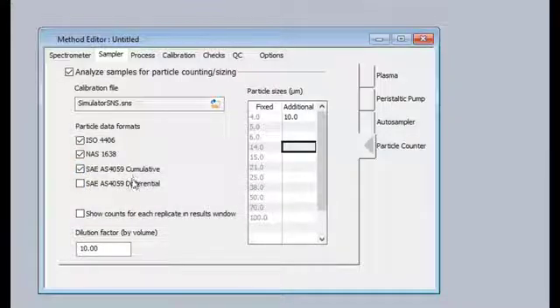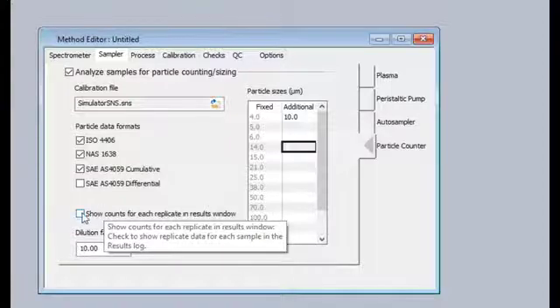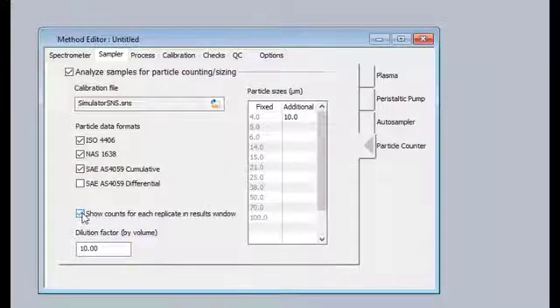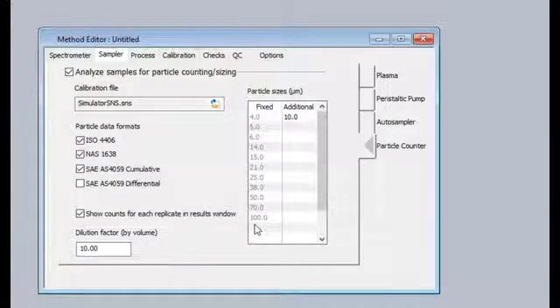The user can also have the individual replicates shown in the results window by selecting this option. A dilution factor must also be input for the results to be accurate. With the method saved and a sample information file created, we are ready for analysis.